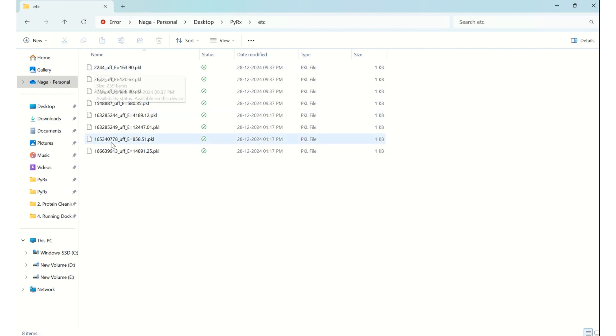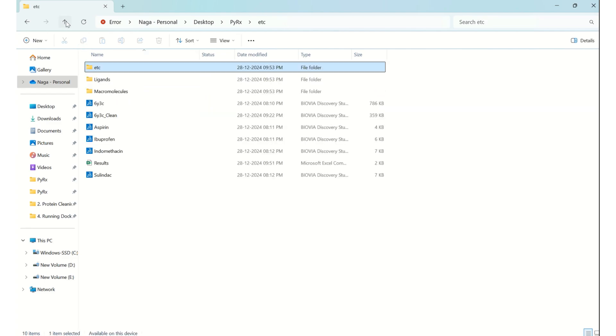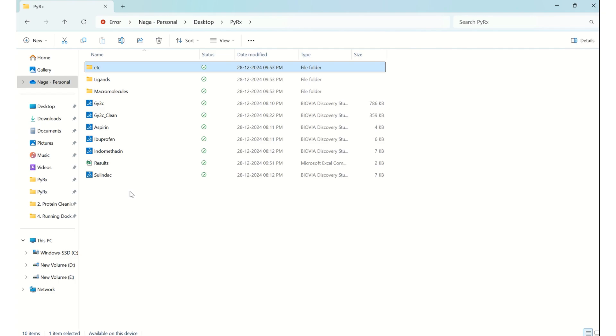And you can see extra information which was used by PyRx. By the end of this tutorial Part 4, you should be able to find all these things in your working folder.